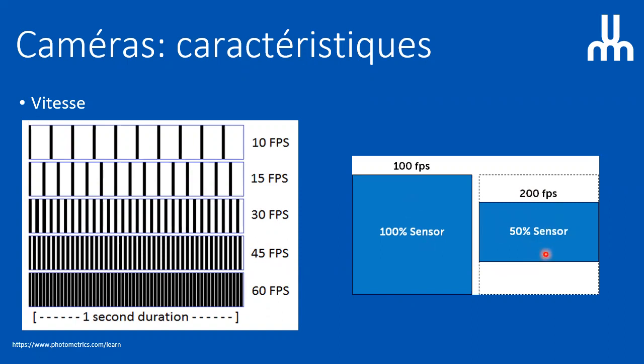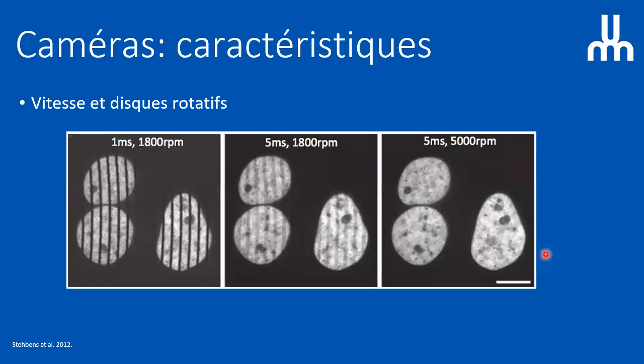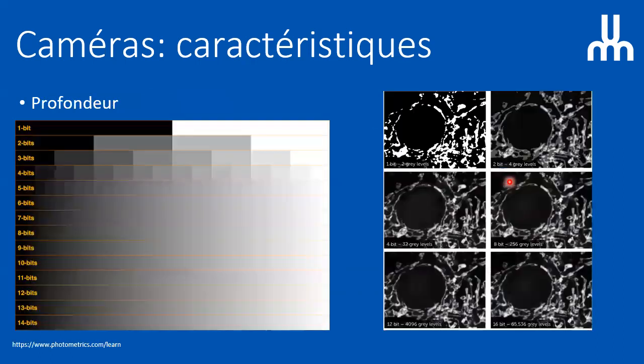to have the full view. So in the spinning disk side of things, the speed of the disk is also important. If you have a mismatch between the speed of the camera and the disk, then you will actually see the ray of light because you are not doing a full cycle around the time you have to image. So you have to match the speed of the spinning disk and the speed of the camera.